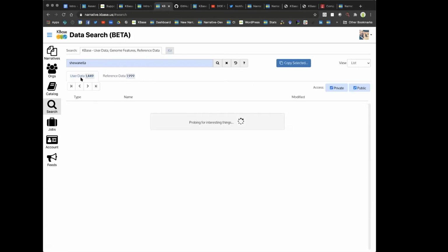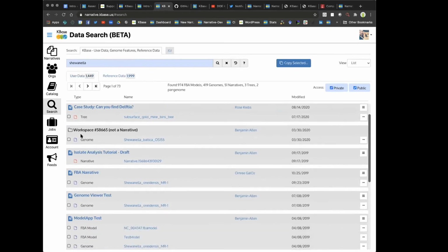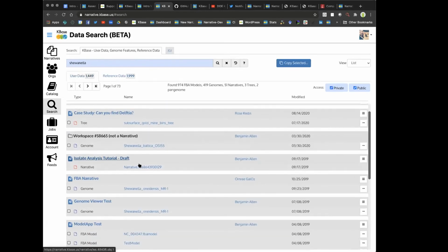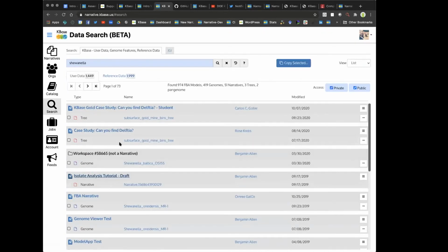It does find narratives too, so you can see these public narratives here. It's finding some stuff that I've made. It has this in here to indicate that it is a narrative, and there's things inside this narrative that may have hits. So that can be useful if you're trying to find public narratives that are interesting to you. So keep working down here to the jobs tab, and it is loading that up.